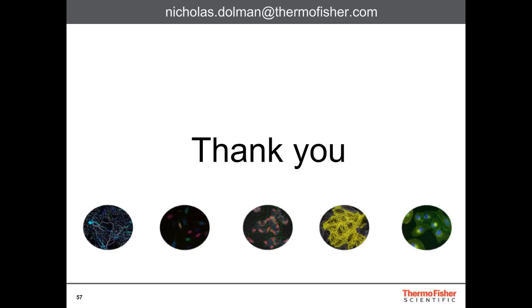Yeah, I mean, we've seen high content really deployed across the spectrum of drug discovery, not only from the standard screening of libraries of compounds, from hit to lead campaigns, but also in discovery biology and pathway analysis. So you can actually start to look and interrogate the biological signaling cascades that might be targeted in a therapeutic campaign, as well as once you have your target in mind, actually screening whether or not the compounds are working. So it's really deployed across the board, as well as in toxicity profiling once a compound is a little further on.